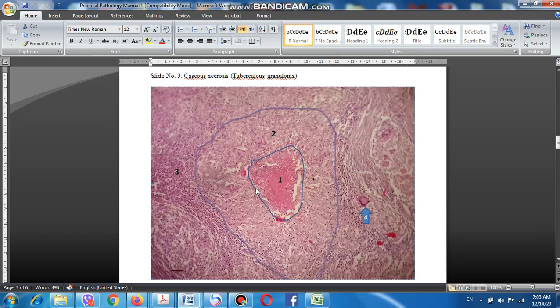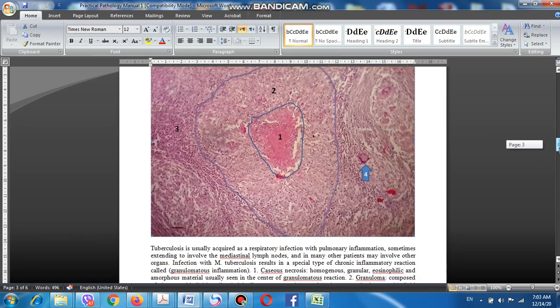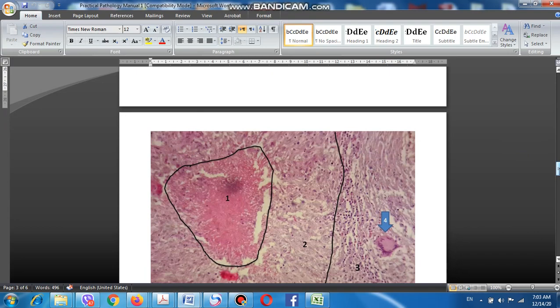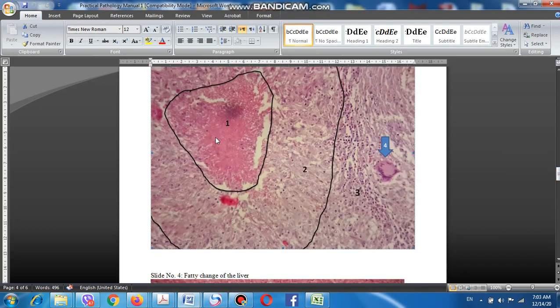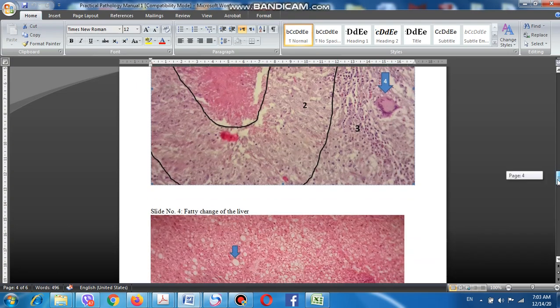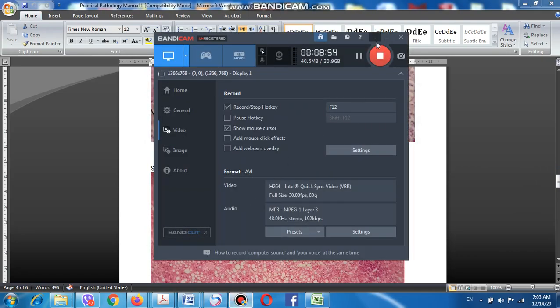Under high power magnification of caseous necrosis, you can see that this type of necrosis is in the center of granulomatous inflammation, surrounded by a large number of lymphocytes. Sometimes we can find giant cells known as Langerhans-type giant cells. This is the classical appearance of tuberculosis.